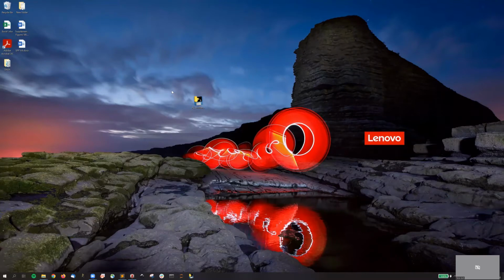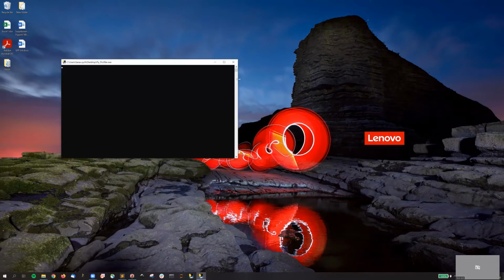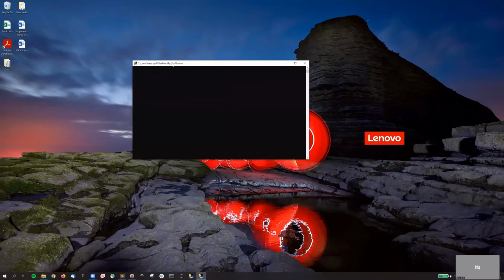Welcome to the tutorial for PyProfiler, which is the software for analysis of the data obtained by single particle profiler technology. When you download the software, it will appear as a single file distribution, something like this. In order to open it, you just need to double click. Then you wait a little bit. Usually when you launch it, especially the first time, it will be a little bit slow.